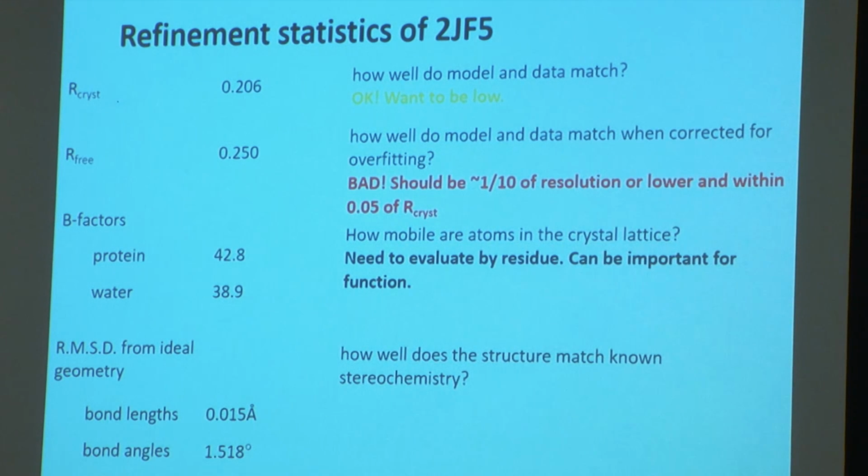And the B factor of water is often included just so that people who are looking at the crystal structure afterwards can decide whether that water is really there, really was part of the electron density, or whether it's just an artifact of over-refinement or something like that.